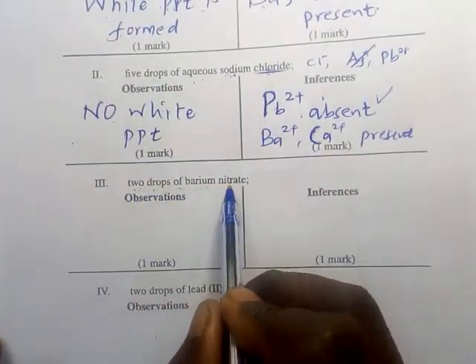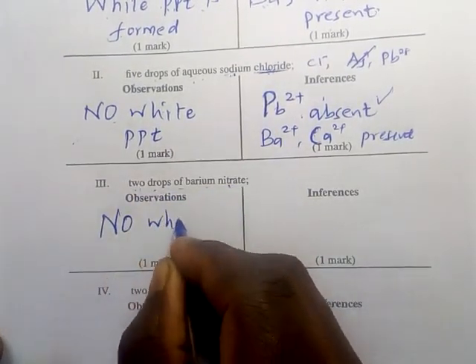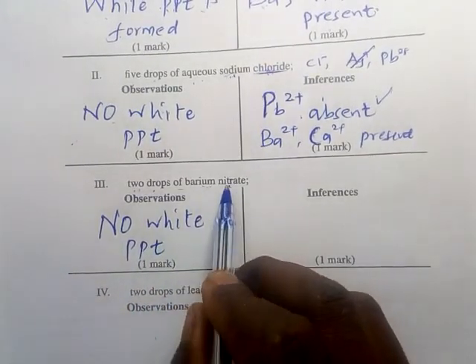To about 2 centimeters cube of solution E, add 2 drops of barium nitrate. No white precipitate.